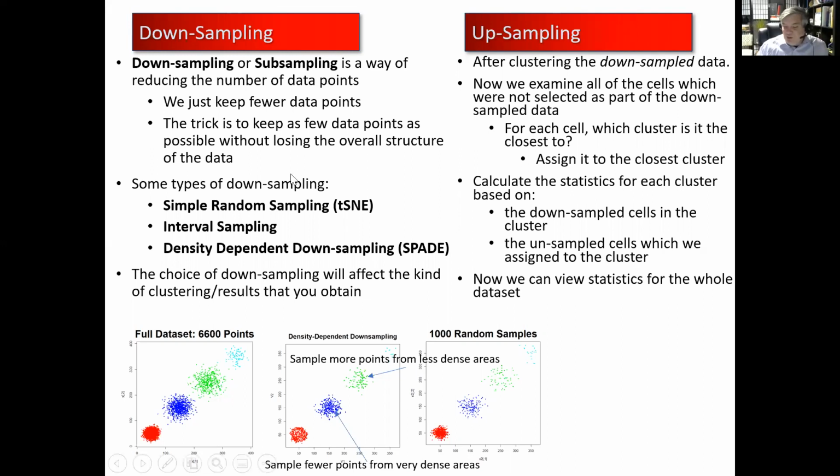But with biological data, and when we run flow cytometry, it's an interesting problem. Biological data is unique because often those really rare populations, things like stem cell populations, minimal residual disease, are the most interesting stuff for us as scientists. We want to know what's going on with that 0.1% of data files. So if you had a full data set and you randomly sampled 1,000 data points, and I have this rare, light blue stuff up here, eventually I'm going to sample that stuff out.